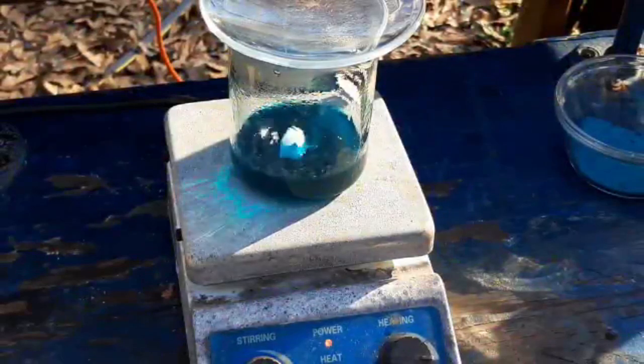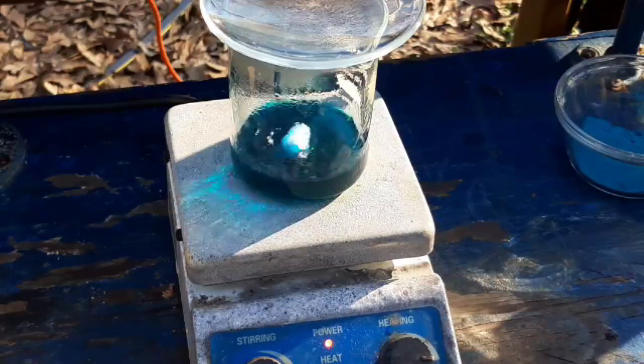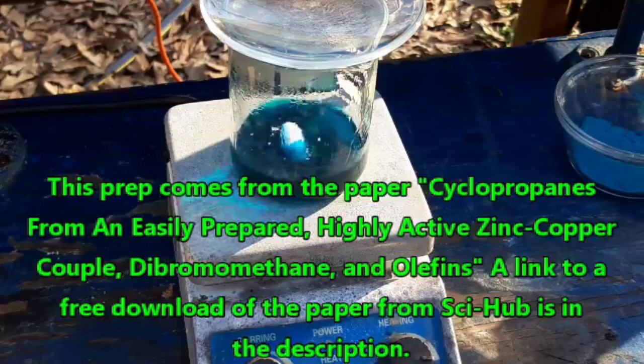Hello, everybody, and welcome back to the Poor Man's Chemist. In this video, I want to try preparing the zinc-copper couple that is used in the Simmons-Smith cyclopropane synthesis that we discussed in the last organic lecture video.